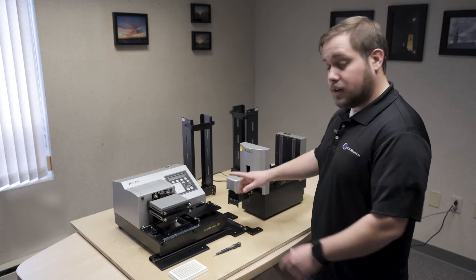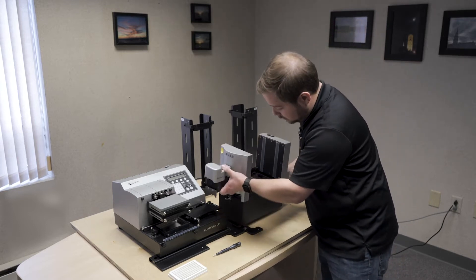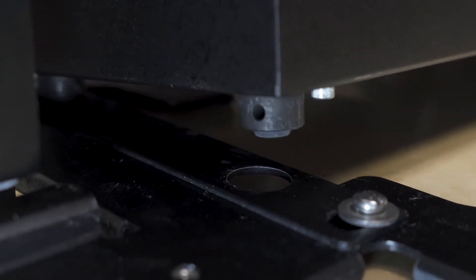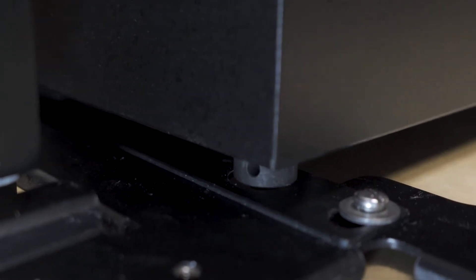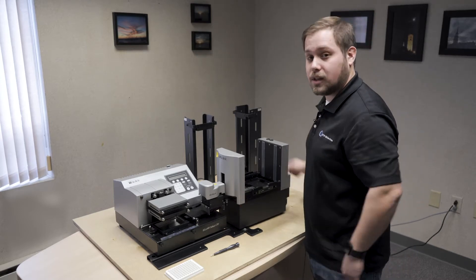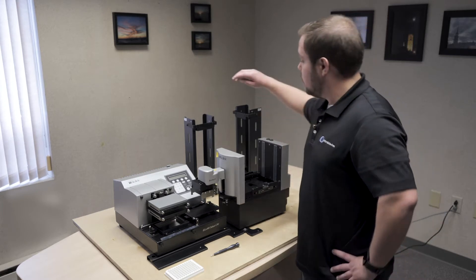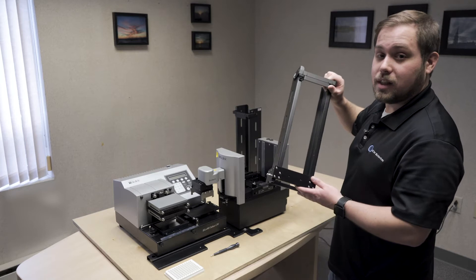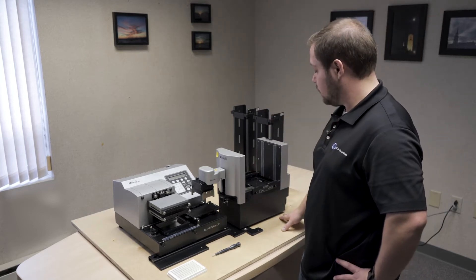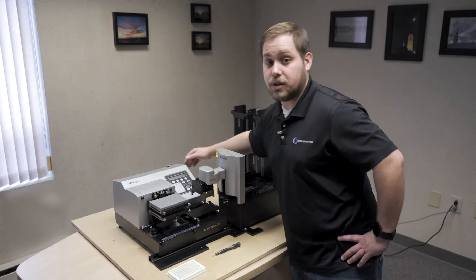Once the mounting plate is in place underneath the plate washer, you'll take your biotech and physically place it in the positioning on the mount plate. Once that's done, go ahead and turn on the biotech stack to initialize it. While that's running, make sure that you have your stacks — we'll need these later for the alignment itself. After the biotech stack is homed, you can turn on the plate washer. We'll need this to run the utility.